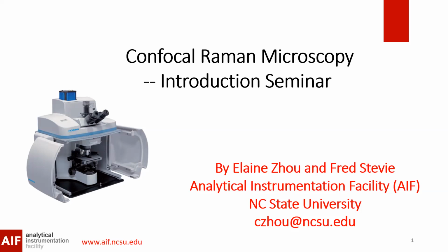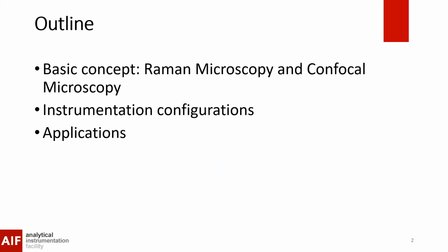I would not say I am an expert on this topic since I started to learn Raman about 3 years ago, but I would be very happy to share with you what I learned gradually over the years. In this talk, I will walk you through the basic concepts of Raman microscopy and confocal microscopy, followed by Raman instrumentation configurations, with more focus on gratings and the factors that determine spectral resolution and spectral coverage.